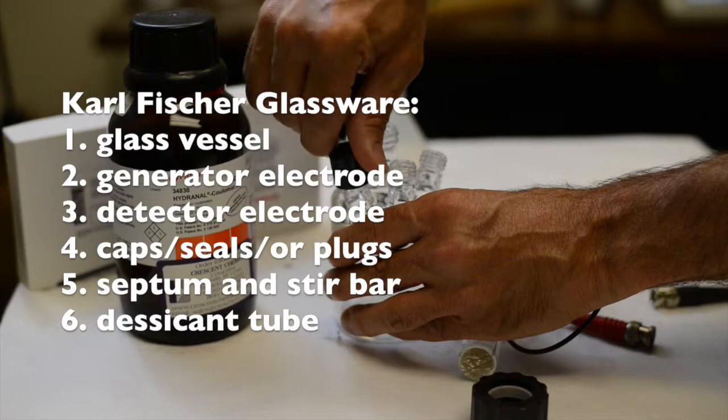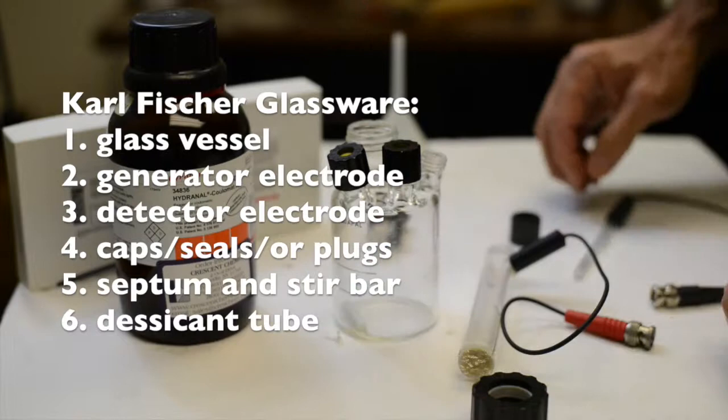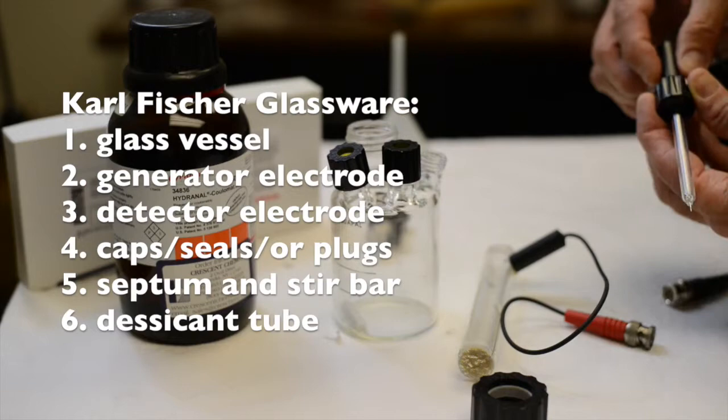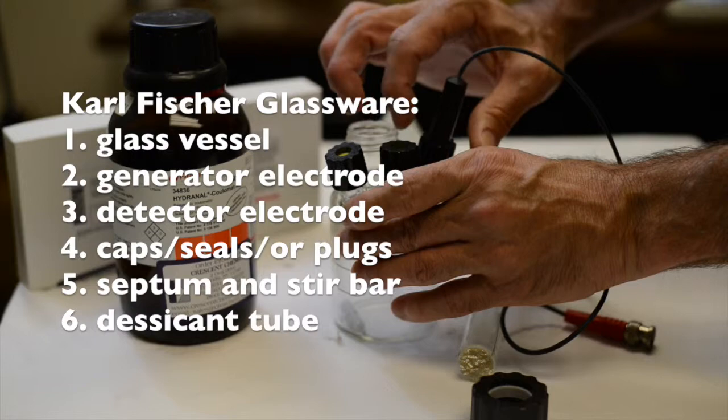The generator electrode is a larger diameter electrode that creates the electrochemical reaction in the vessel. The generator electrode can come as a single or a dual reagent electrode. The detector electrode is a smaller diameter electrode and as its name reveals, it is designed to detect for any moisture inside the vessel.